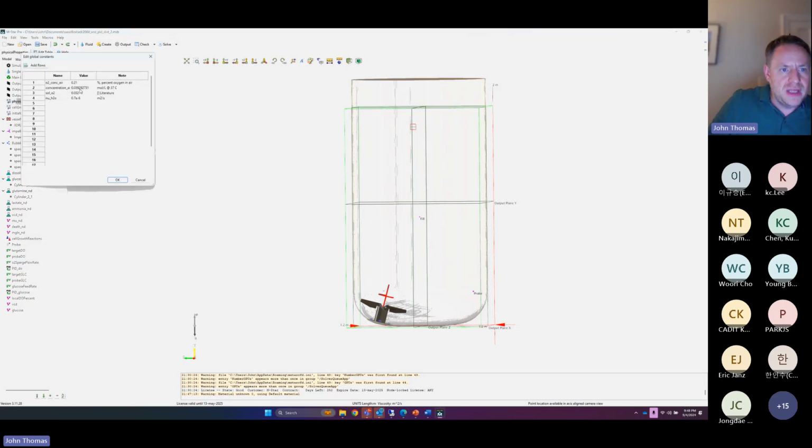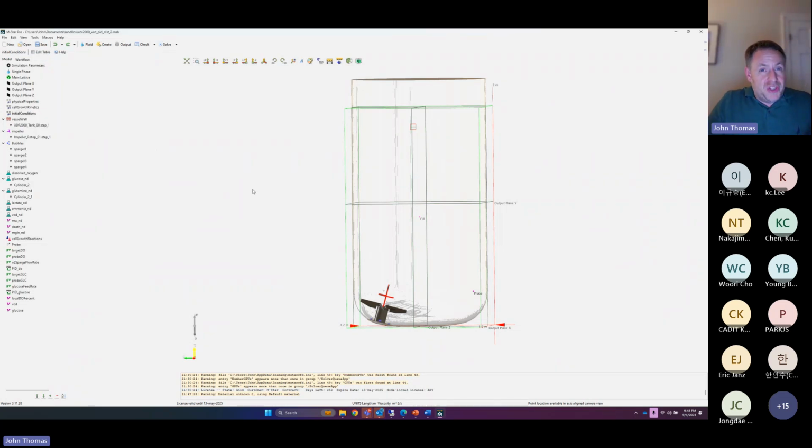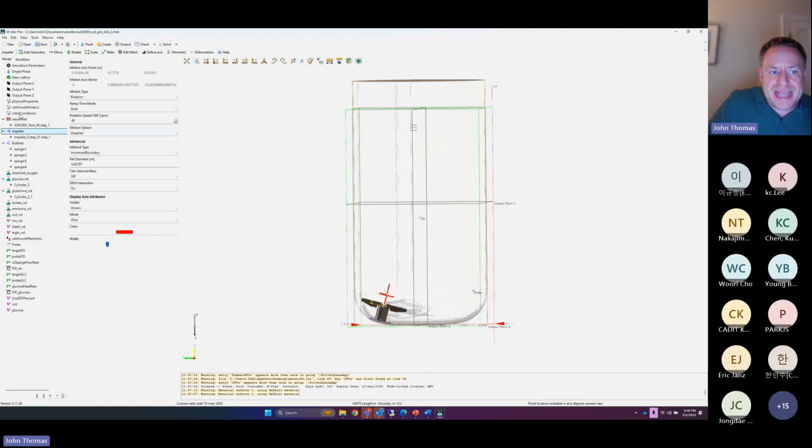What are the inputs? Physical properties, concentration, solubilities. We have cell growth kinetics. These are the maintenance coefficients and conversion factors, as it were. We have initial conditions that describe what my initial glucose, glutamine, viable cell density might be. But these are the physics that go in. So whether this is 1,000 liter, 20 liter, 250 milliliters, as it were, whether it's a 10,000 liter vessel, these physics don't change. Yes, the PID controller might change. Yes, the wall and the impeller topology might change. But because I have these physics wired up, they're good to go.